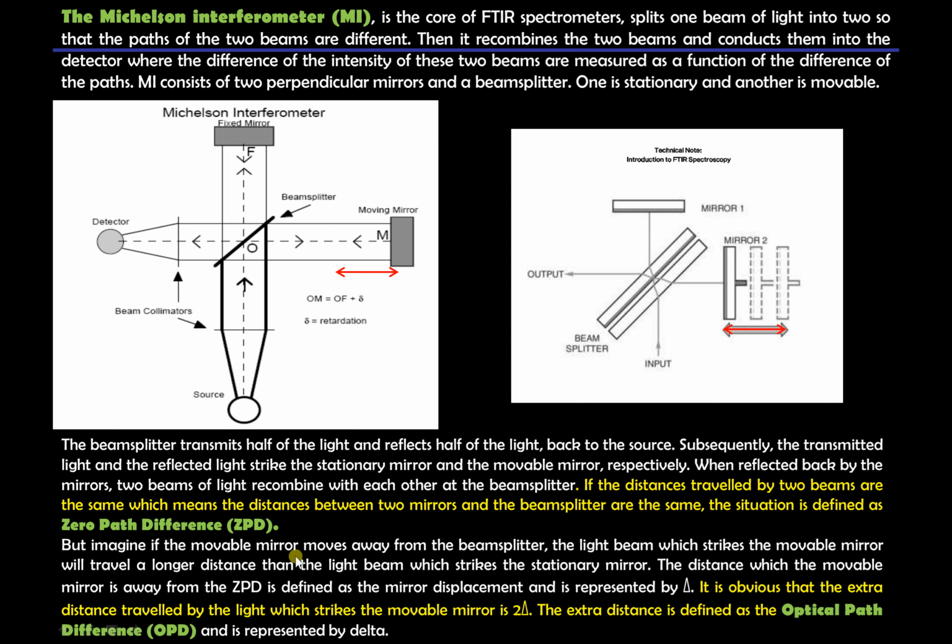But imagine if the movable mirror moves away from the beam splitter. The light beam which strikes the movable mirror has to travel a longer distance than the light beam which strikes the stationary mirror.